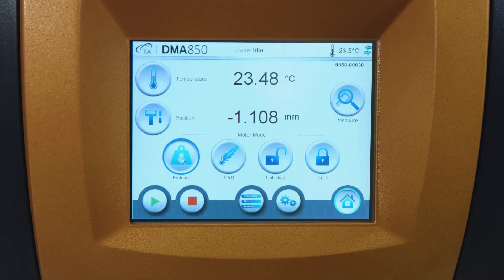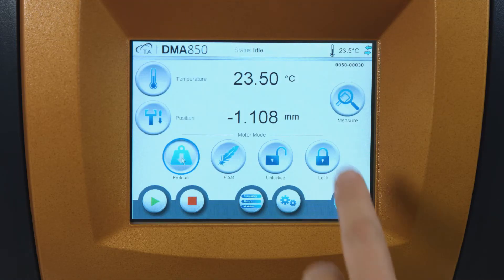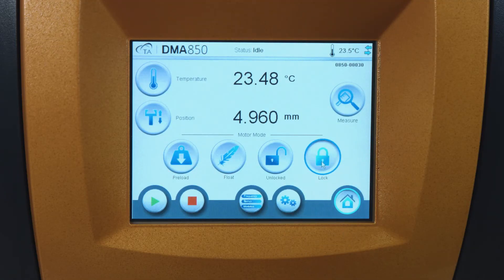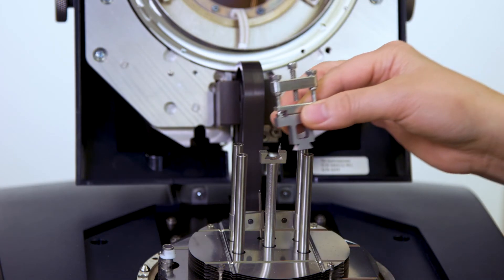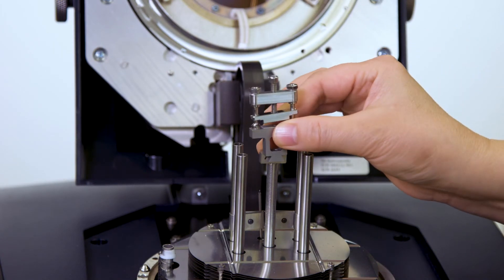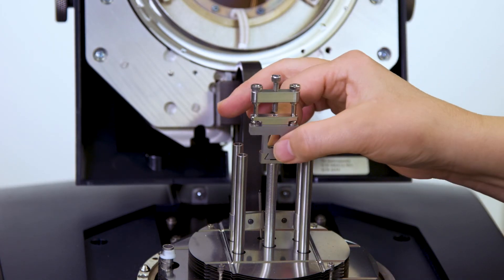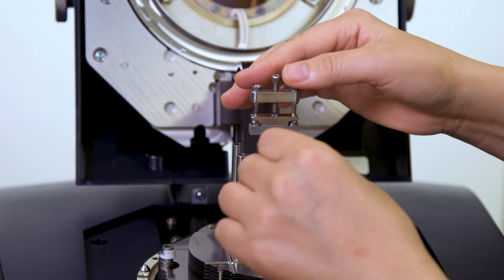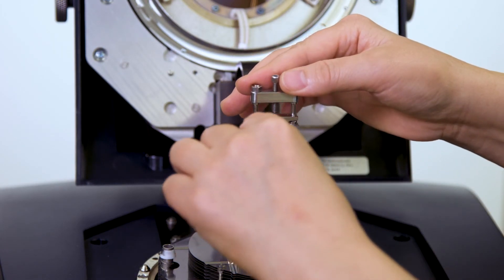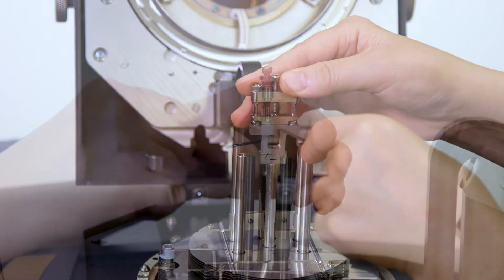From the instrument touch screen, lock the drive shaft. Install the movable clamp to the drive shaft. Then close the furnace.